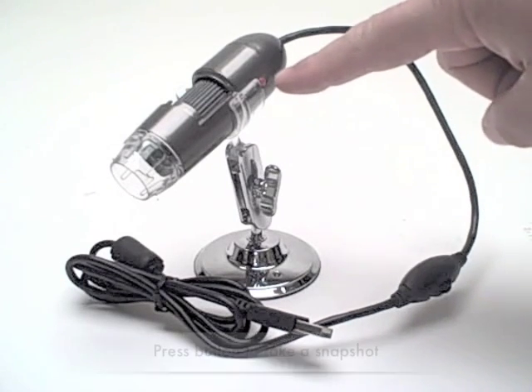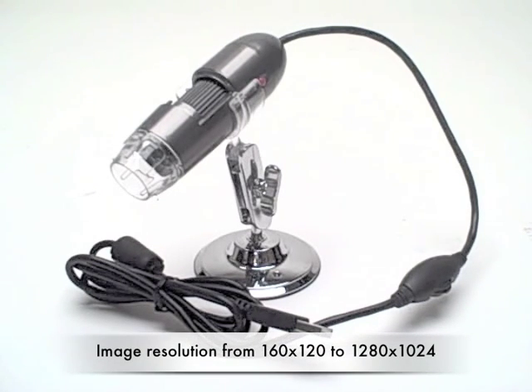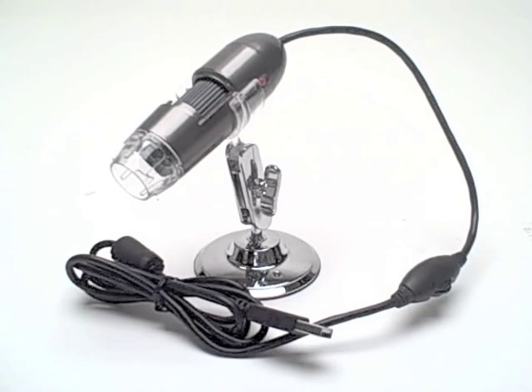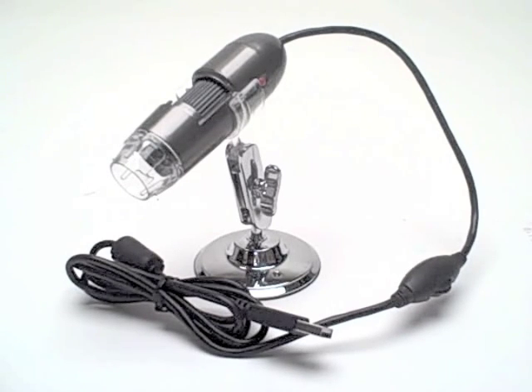There's also a red button here enabling you to take a snapshot. Image resolution ranges from 160 by 120 out to 1280 by 1024, and it has an excellent transmission rate at 320 by 240 pixels of 30 frames per second.